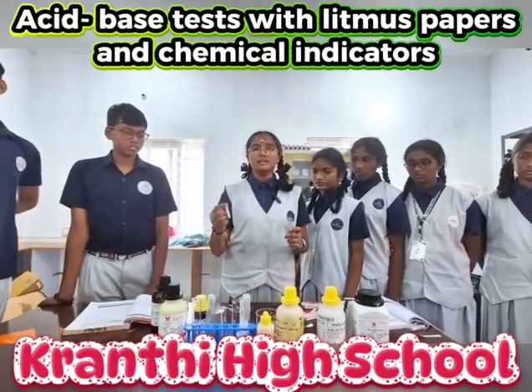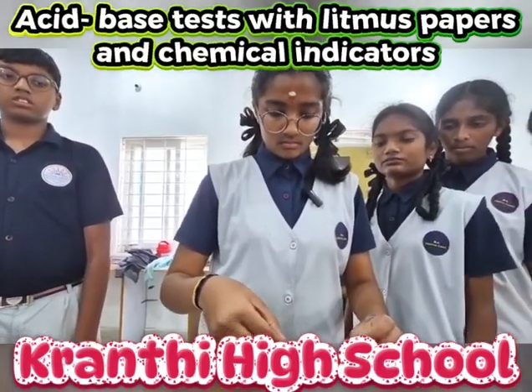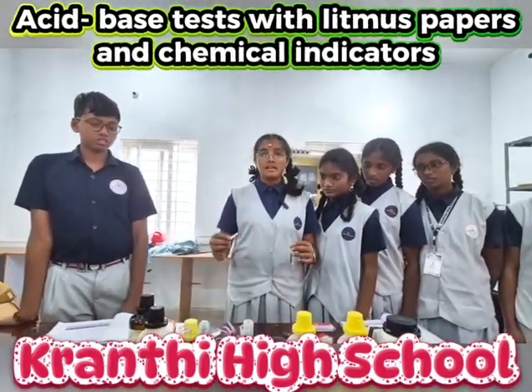Now we'll dip red litmus paper into it. The red litmus paper did not change its color because it is an acid.